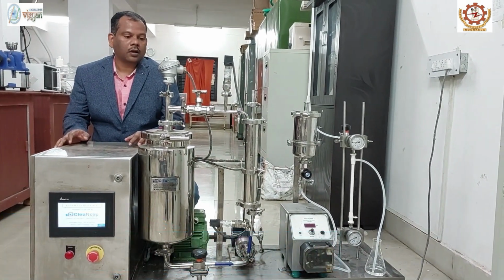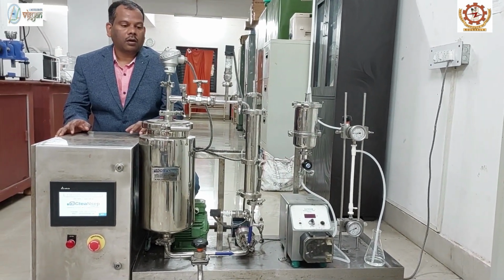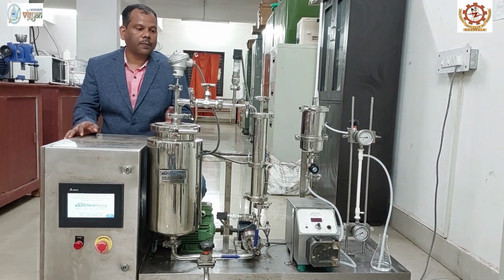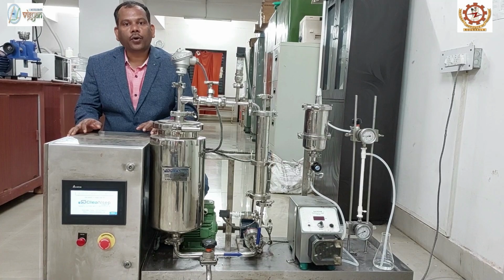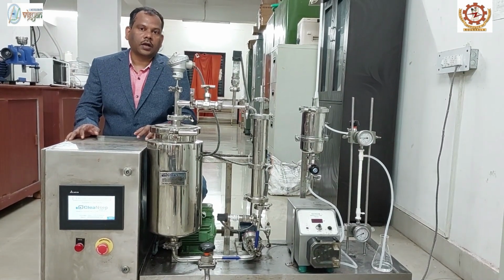We will demonstrate this membrane filtration unit for the fruit juice. As we know, membrane filtration nowadays plays an important role in the juice processing industry, that is, the food processing industry.